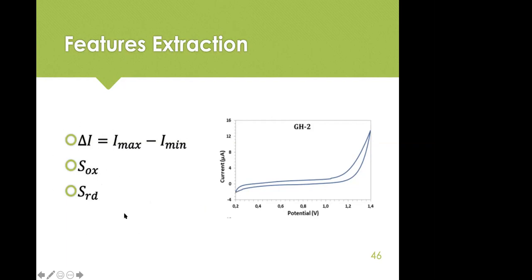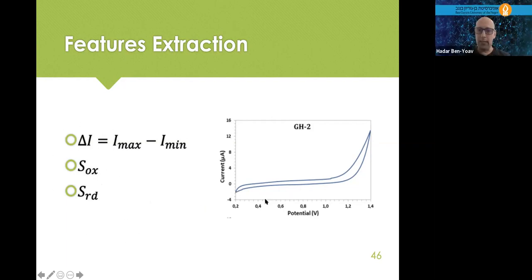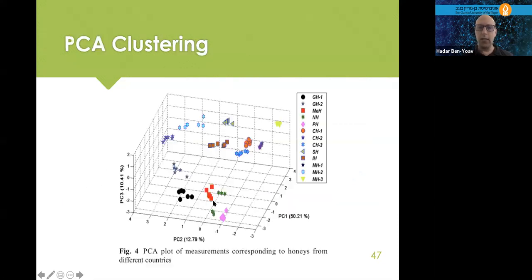So they take those 3 different parameters, they do the data processing, they extract these 3 different values for each electrode, and then they took all the data and put it in a PCA, applying the PCA algorithm in an unsupervised way. First, I want to see all the data to see if there is some kind of clusters or structure in the data.